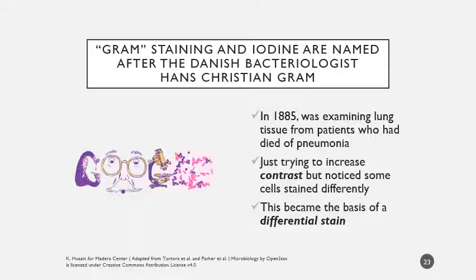So this is called a differential stain. It highlights differences between different organisms. And that is, again, based on structure, and it's our first foray into diagnostics.